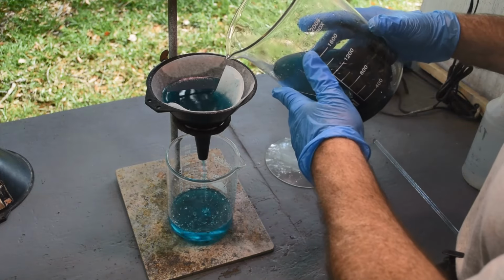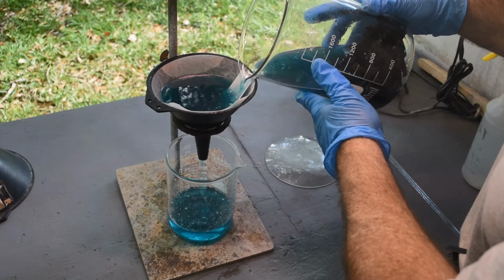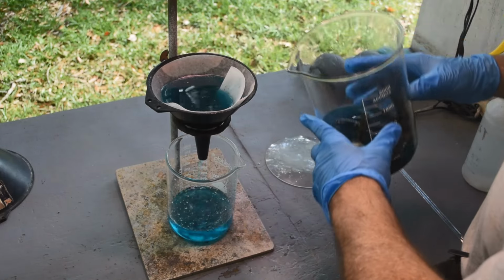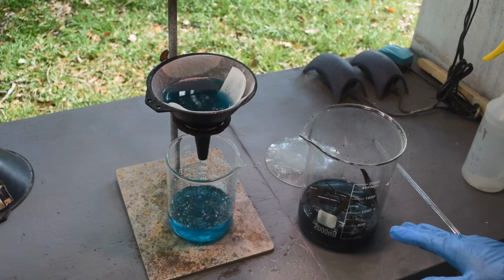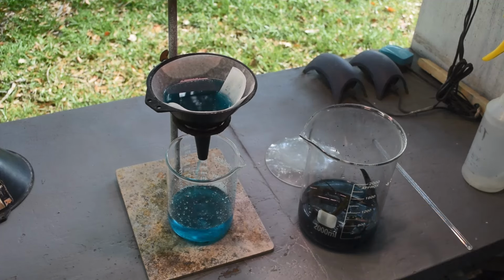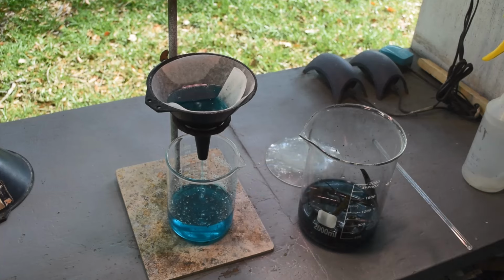So let me get the bulk of this blue liquid off of here. I may give this stuff a rinse with water as well, and I'll probably use purified or distilled water so that we don't get any chlorine in here, because there's a lot of nitrates in here, and I don't want to make any aqua regia because that would probably put some of the palladium in solution too. And once I have this stuff rinsed, we will move on to the main mechanical separation process. It's just going to take a while to get it all filtered through this funnel.